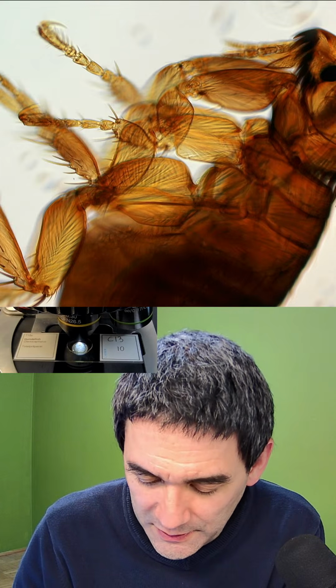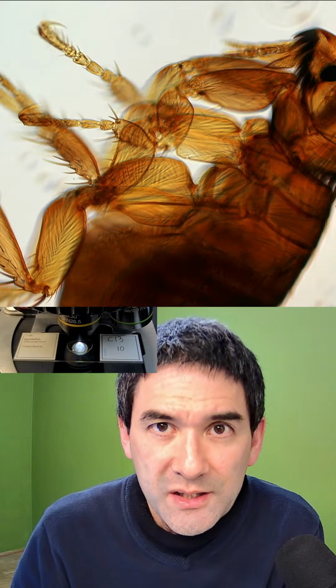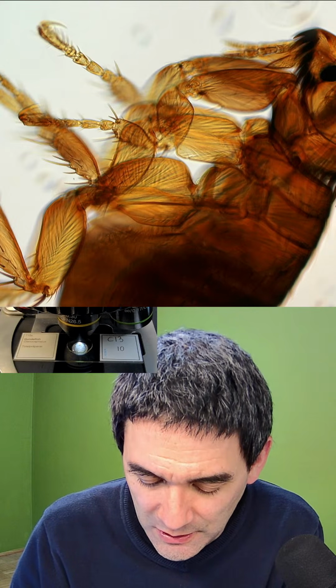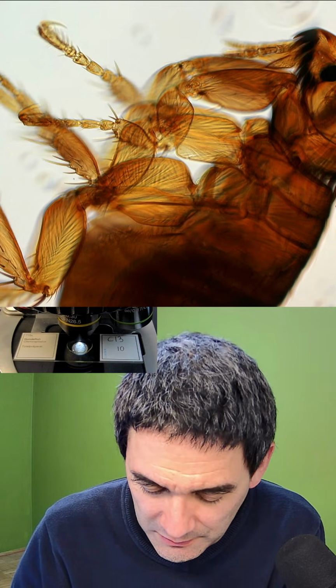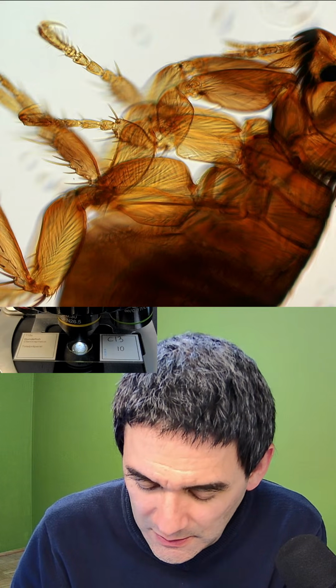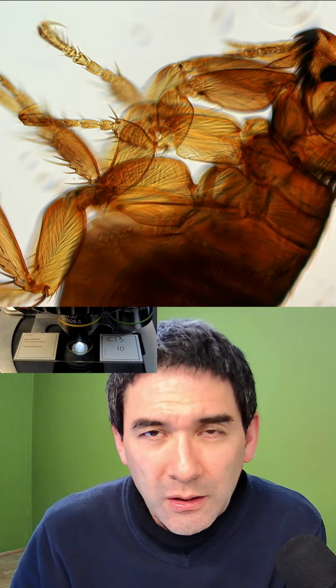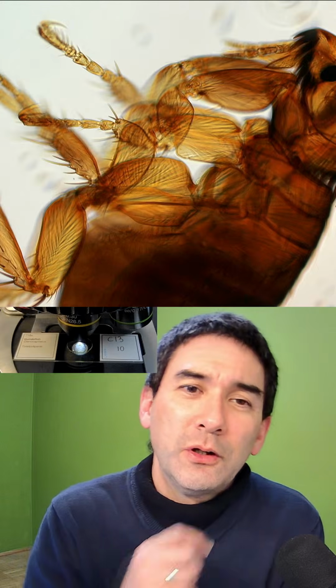The comment that basically I should handle some of the slides with gloves because of possible poisons which might be on the paper. Dark field, a great way to check for cleanliness. That's possible. I would say the following.